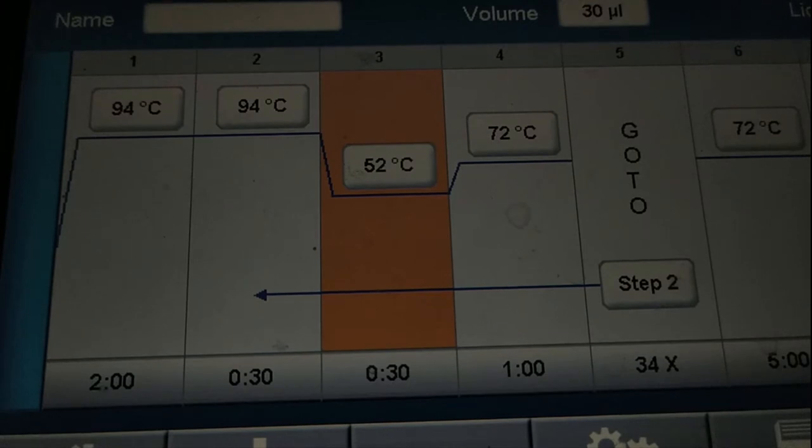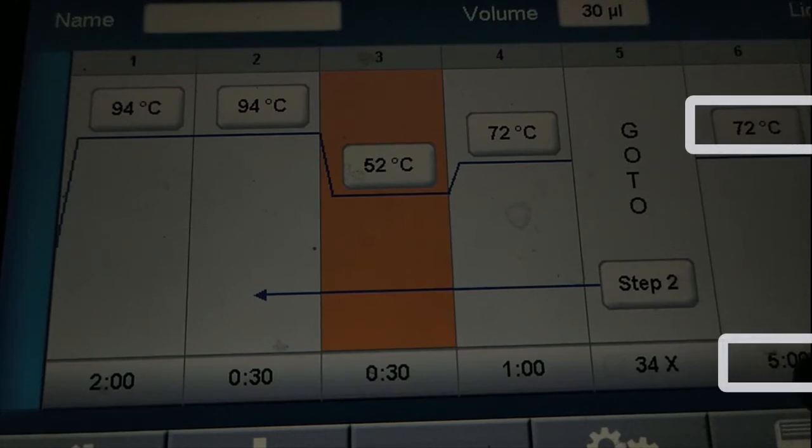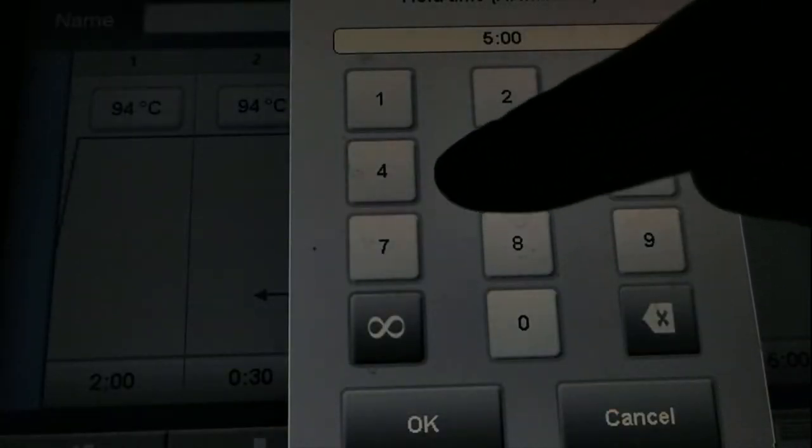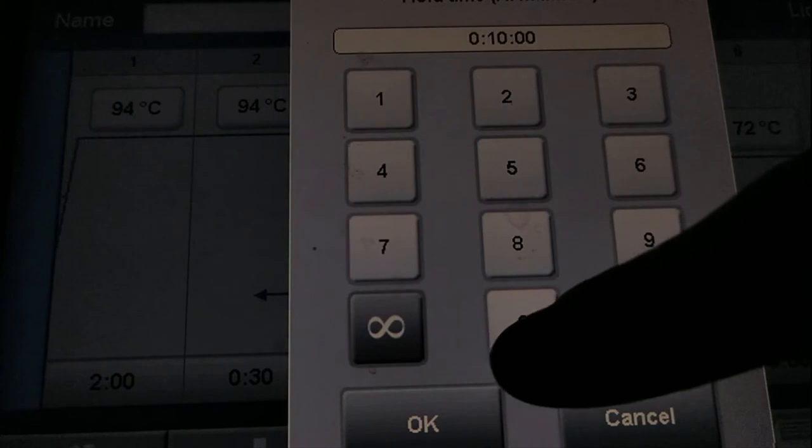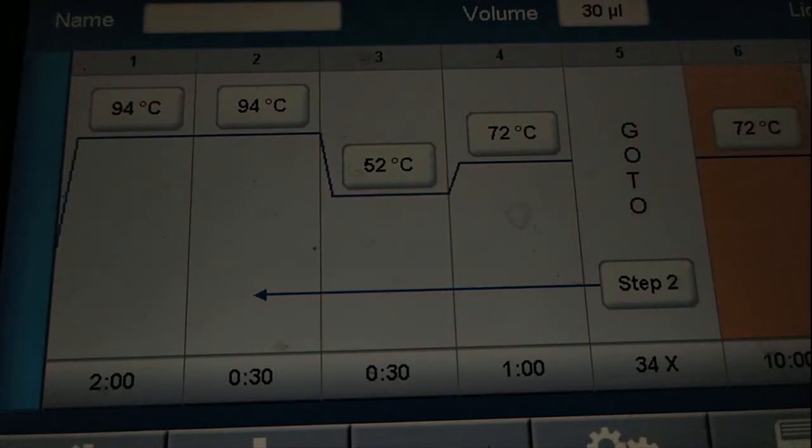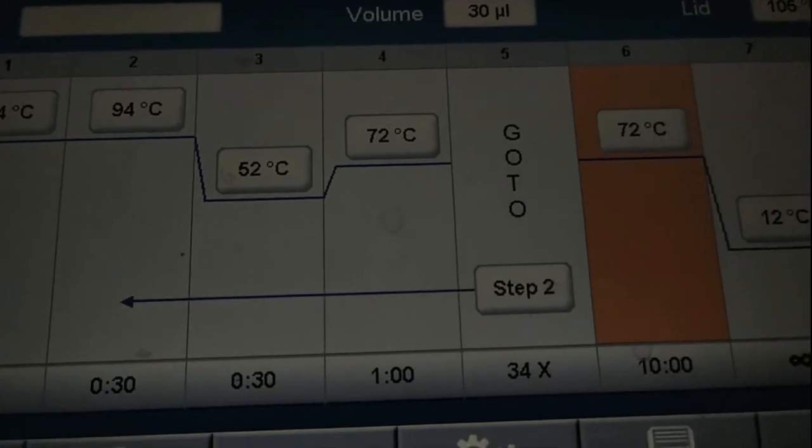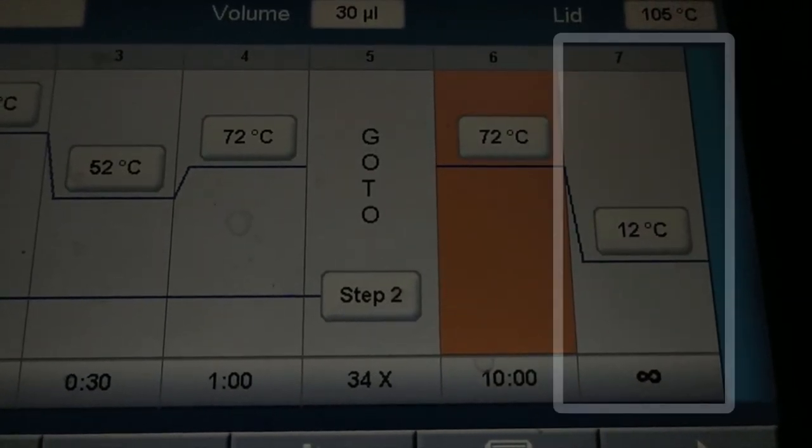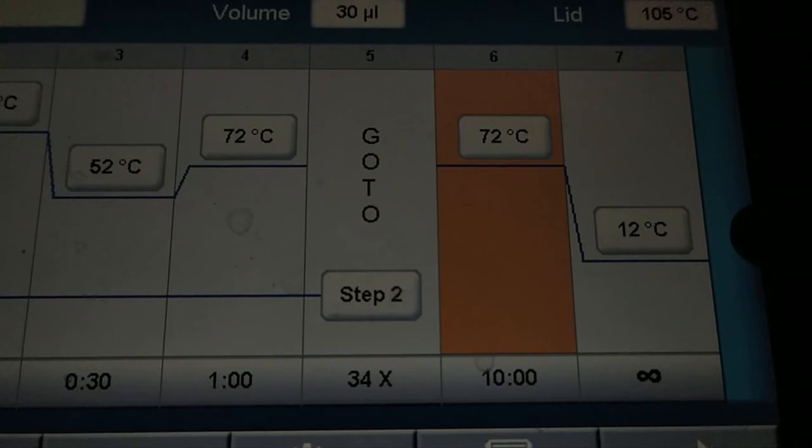Then we have the final extension step and it is set to 72 Celsius degrees for 10 minutes. So press on the time here and set 10 minutes. Then press OK. And finally we have the last step and this step is 12 Celsius degrees to keep our samples for eternal period of time and it is to save our samples from degradation.